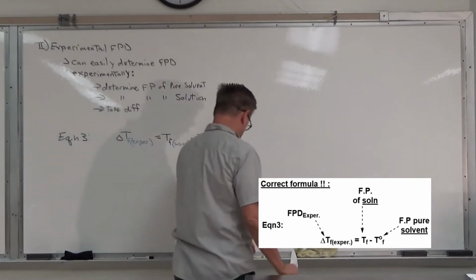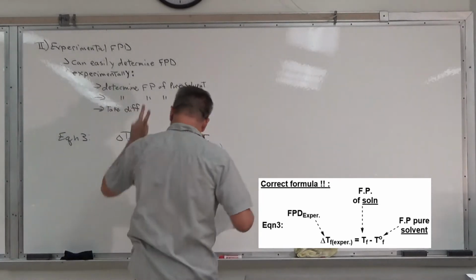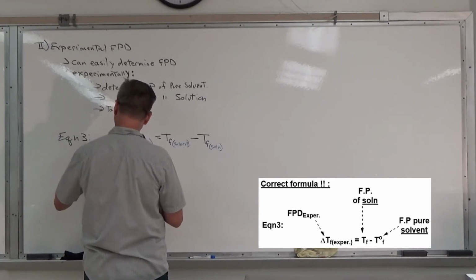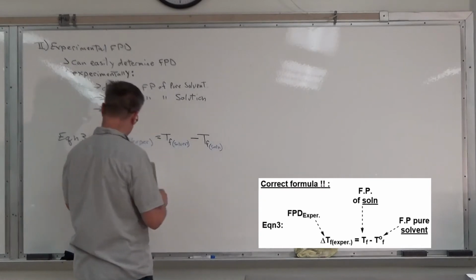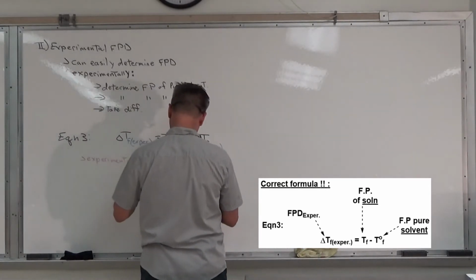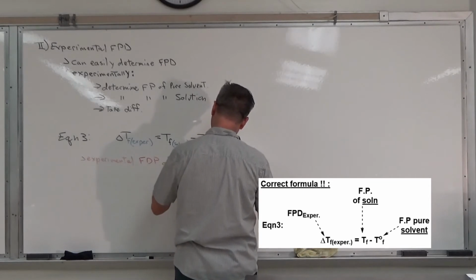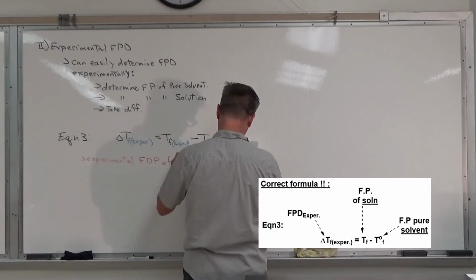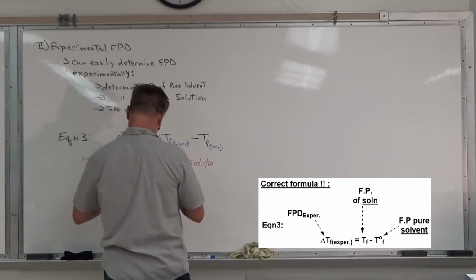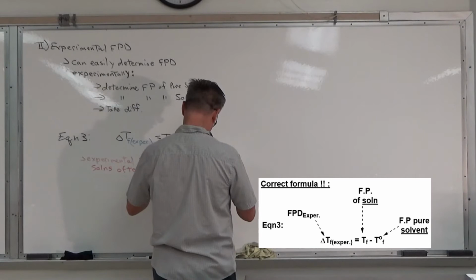Experimental freezing point depression of electrolyte solutions is often less than theoretical.